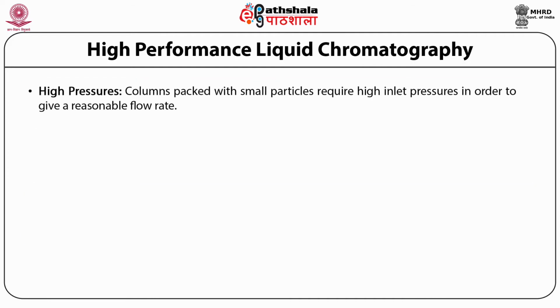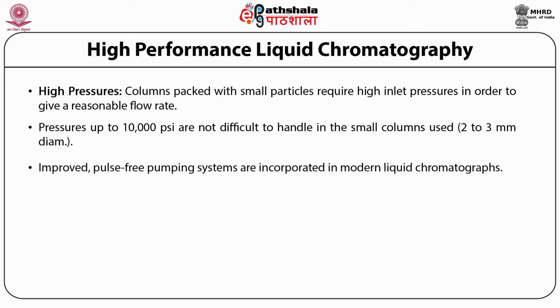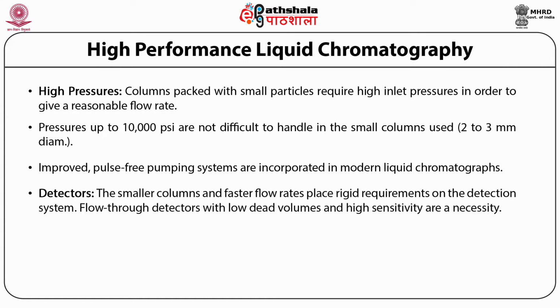Columns packed with small particles require high inlet pressures in order to give a reasonable flow rate. Pressures up to 10,000 psi are not difficult to handle in the small columns used. Improved pulse-free pumping systems are incorporated in modern liquid chromatographs.